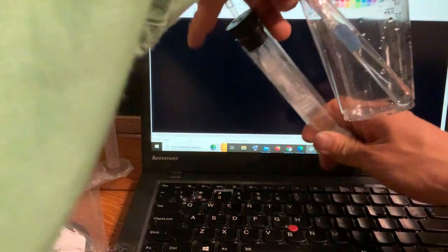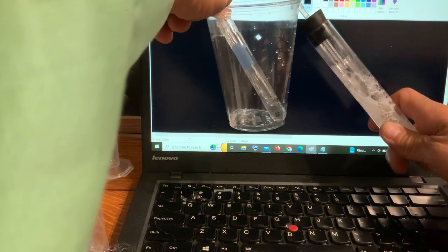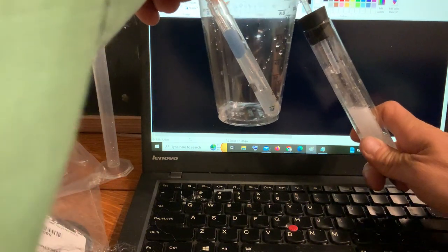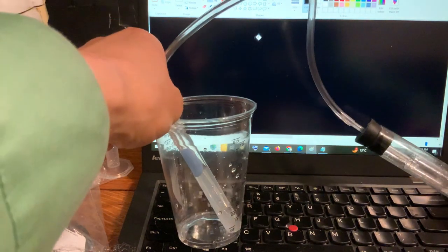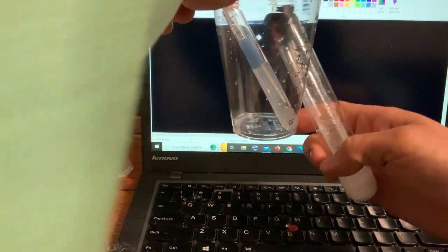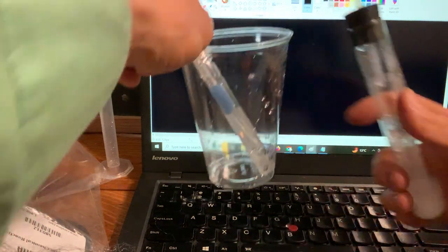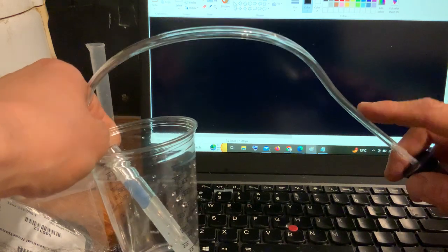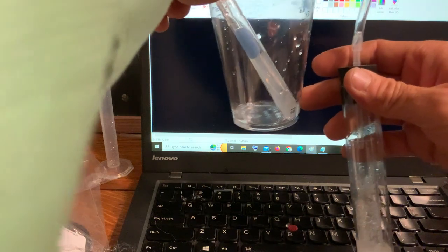Okay. Now I'm going to get some more vinegar here. Okay, there it is. Oh, it works. It works. Oh my God, look at that. Look at that cloudiness. Look, inside the tube, there's nothing, but the water is becoming cloudy. You cannot say that the white stuff in here is getting in that test tube, because look, the tube is perfectly clean. It's not wet, has no white stuff. It was carbon dioxide gas that caused that cloudiness.